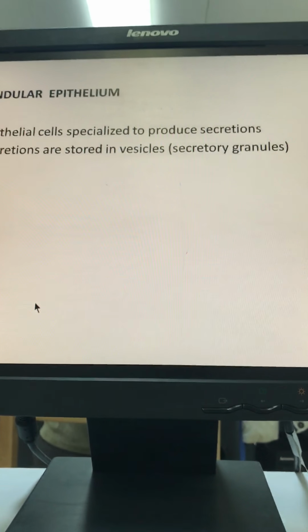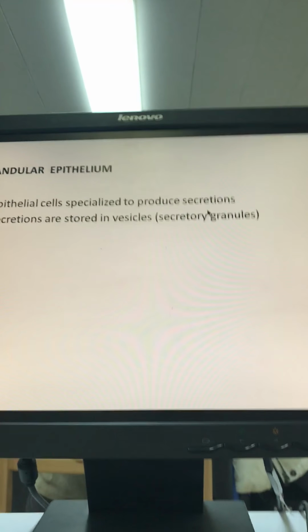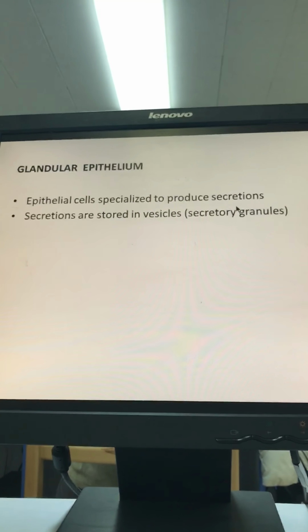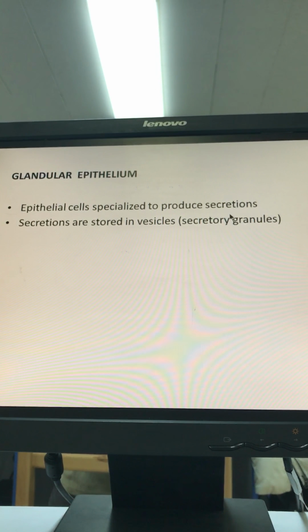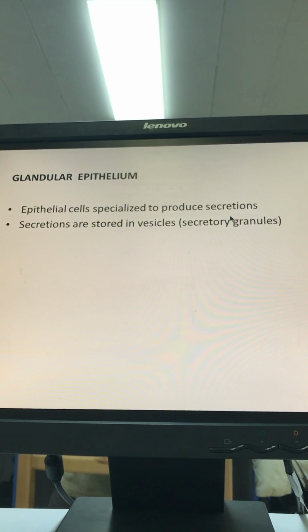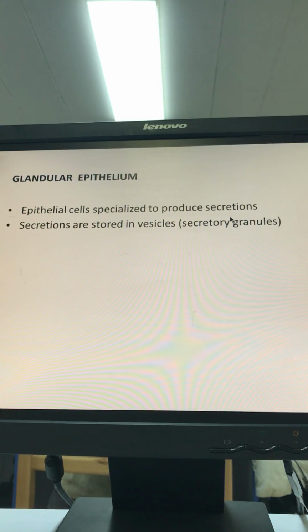Glandular epithelium, where we have epithelial cells that are specialized to produce secretions, okay? فإيش نتوقع الماشينري تكون فيها أكثر؟ Okay, it has more machinery. Cells has more machinery. Then we will have elongated cells. And they will be either cuboidal or columnar. Okay. Then the glandular cells will be longer لأنهم with more machinery.